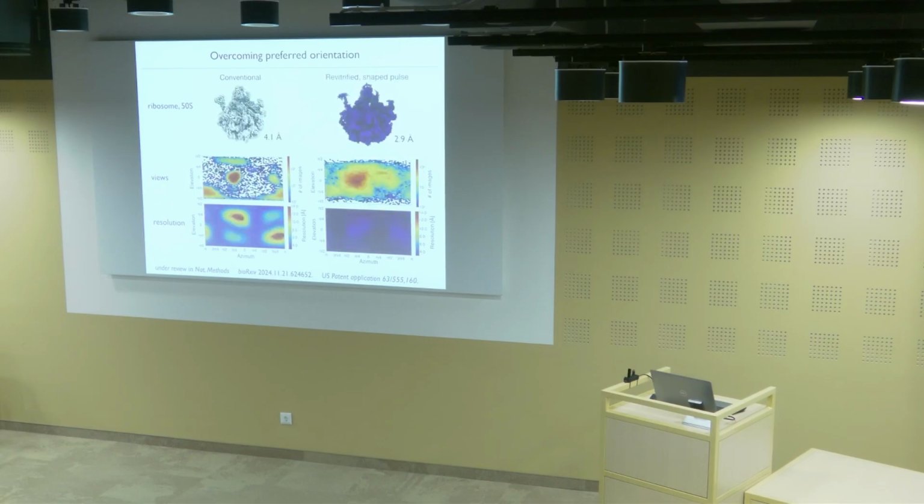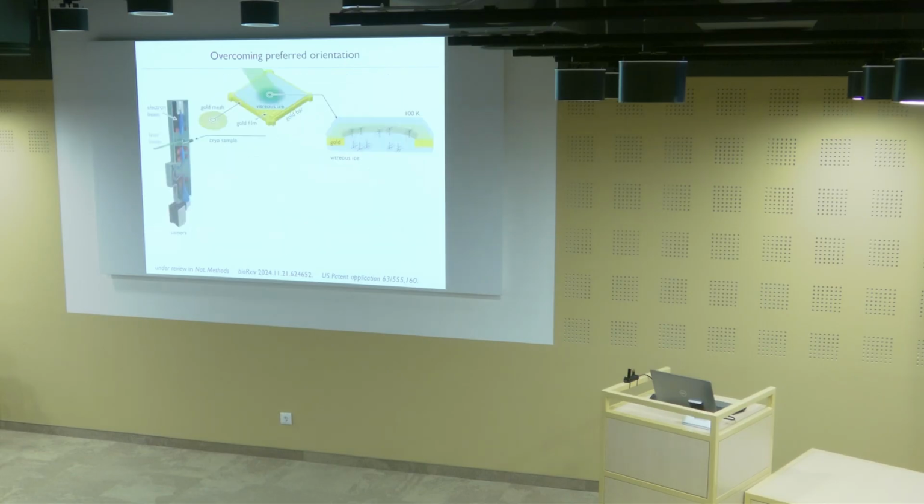The effect gets stronger if we use one of these shaped laser pulses. You can see that here we also get a massive improvement of resolution, going from 4.1 angstrom down to 2.9 angstrom under otherwise identical conditions, right? To put this in perspective, to get this kind of resolution with such a conventional sample, you would have to record 18 times as long, and of course this then very quickly gets prohibitively expensive, right? And so we wondered whether we would be able to do even better, so this is what we did here.